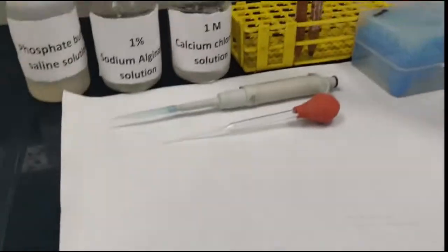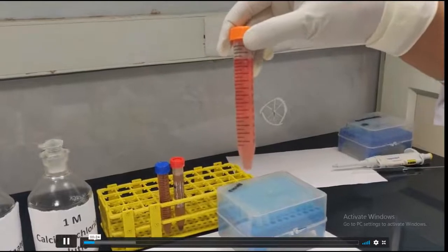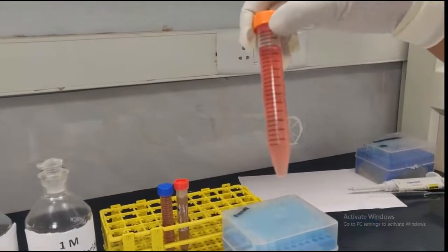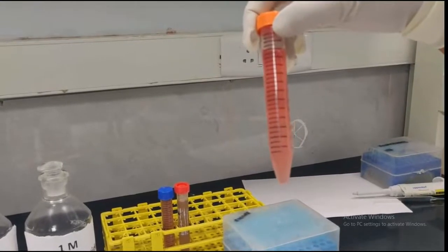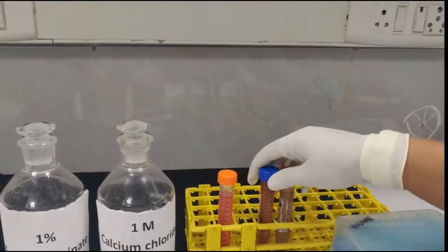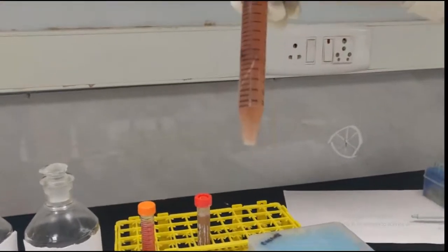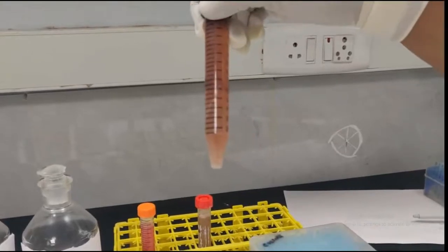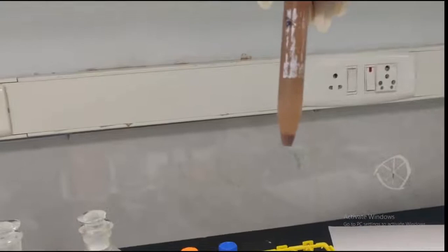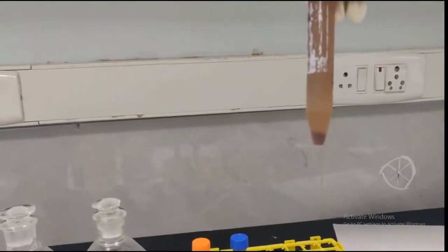Smears, we take a part of the aspirate into a tube containing 10% neutral buffered formalin, and this is how a fresh sample taken in the neutral buffered formalin will appear. Now this tube is then allowed to stand for 24 hours or overnight, and then a nice pellet settles down at the bottom of the tube. This is for the effusion sample, and in the next tube we can see a nice pellet at the bottom after 24 hours of fixation in the neutral buffered formalin.